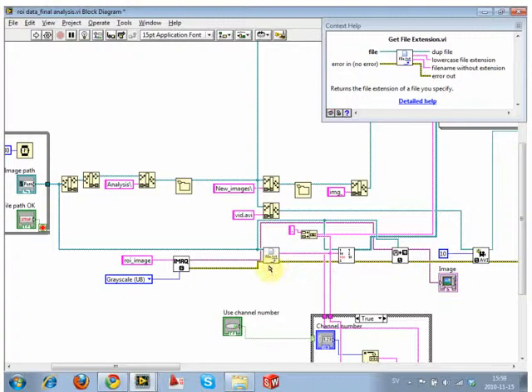Quite commonly what you'll do is actually reverse the string and then index it. If you want to reuse file names, for example, or reuse sections of a file name, the best way to do it is to take the string for the file name and flip it around, because the end is really the only defined point, and then index it based on this side, not this side. Because you can have a whole lot of strings here that vary, but this is quite regular.